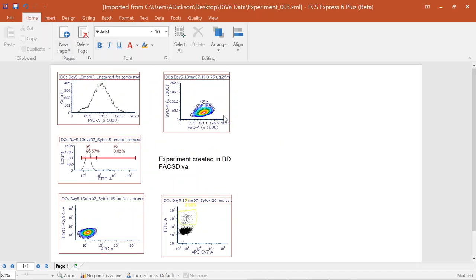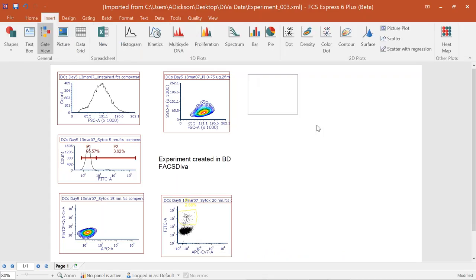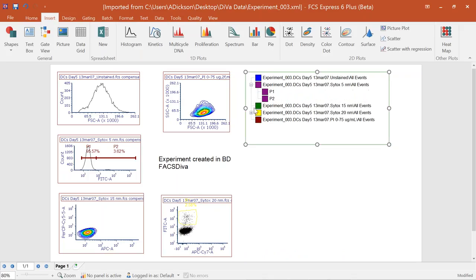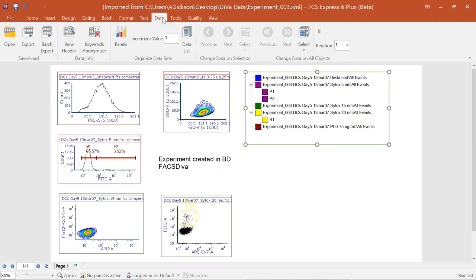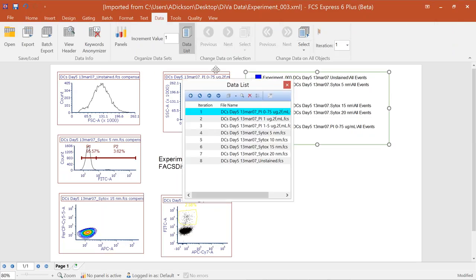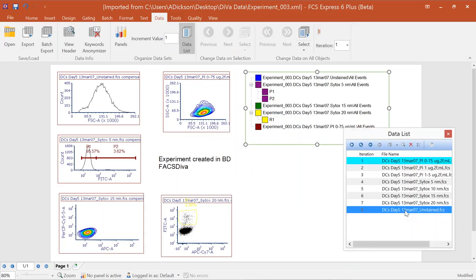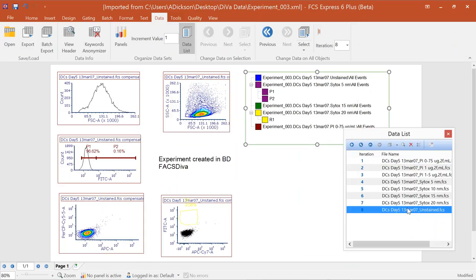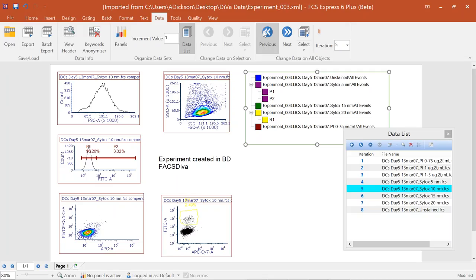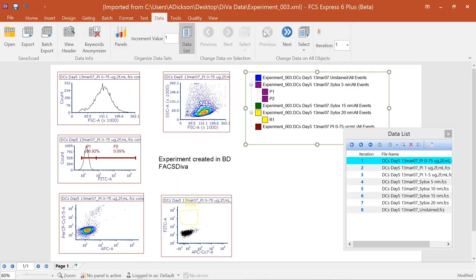Once the import is complete, all plots from DIVA are populated. We also have the gates — inserting the Gate View shows all created gates are available. Not only do we have all the plots, gates, and compensations, but all the data files as well. From the Data tab, I can open my data list, see all available data files, double-click to change the active file, and all plots update accordingly. I can also use the Data tab to scan through different data files.